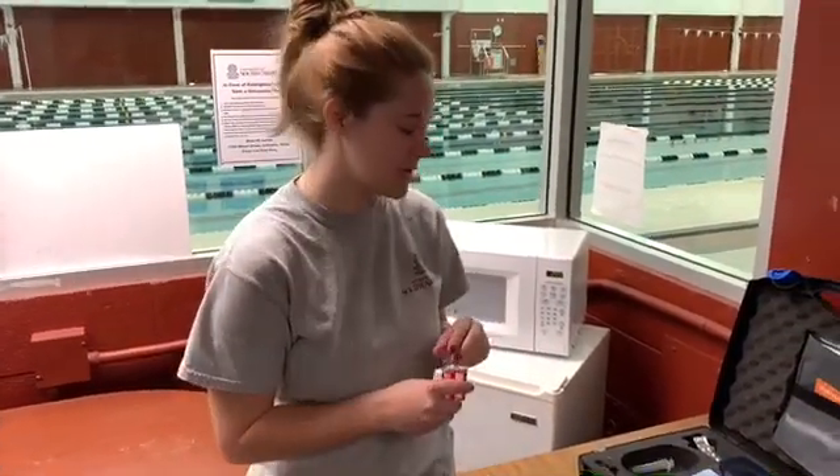Now that we have tested for one pool, we will repeat the process for the other pool. So this is how you do a chemical test.